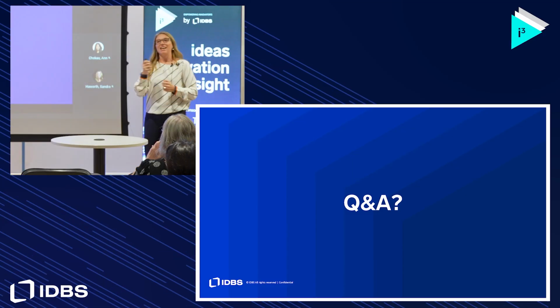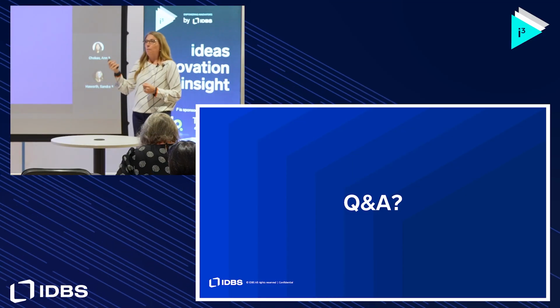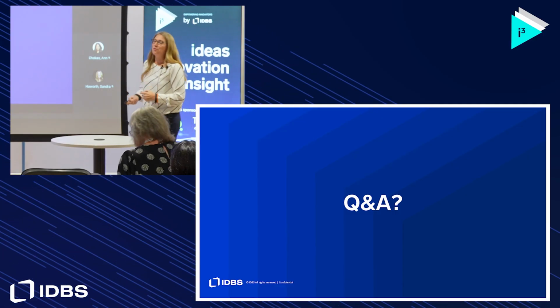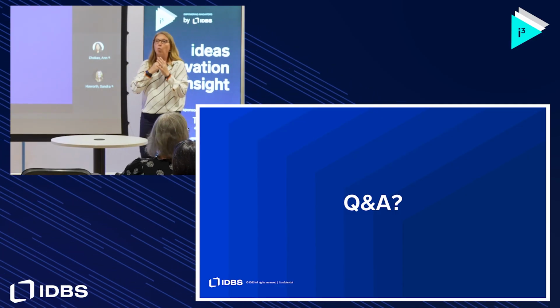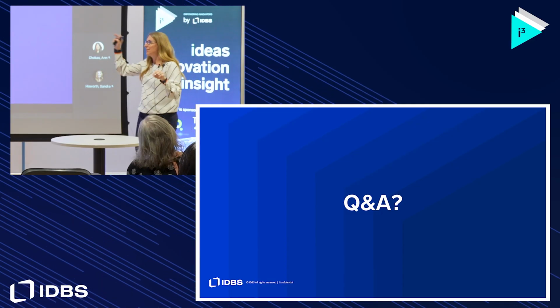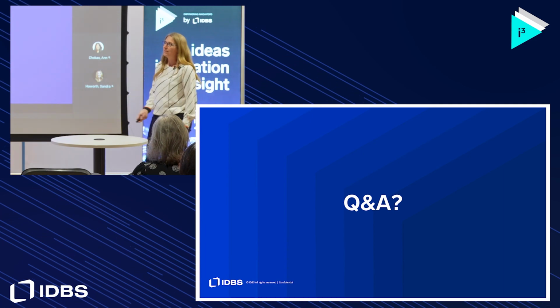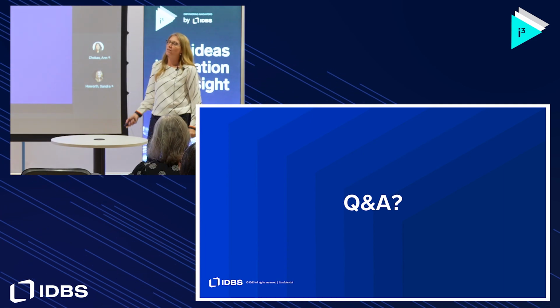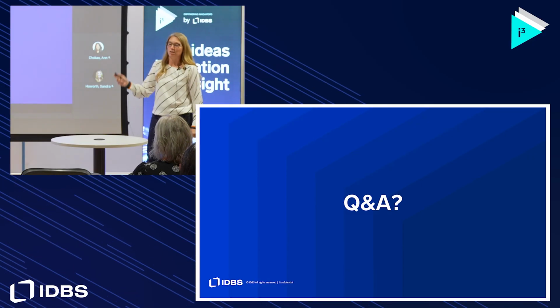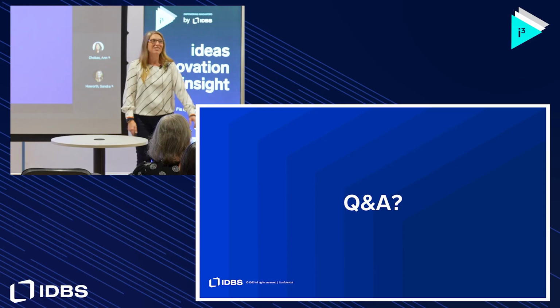Oh, remember, the last thing I wanted to say is, even though you can build all these integrations, they take a long time to get going, but they're worth it. So if you ever have any questions on what is the pathway of the data being sent from the balance to the spreadsheet, I have the diagram, so let me know. There's definitely lots of challenges, but they're worth it. And once the business uses them, like I mentioned, they just depend on them. Anyway, thank you. Any questions?